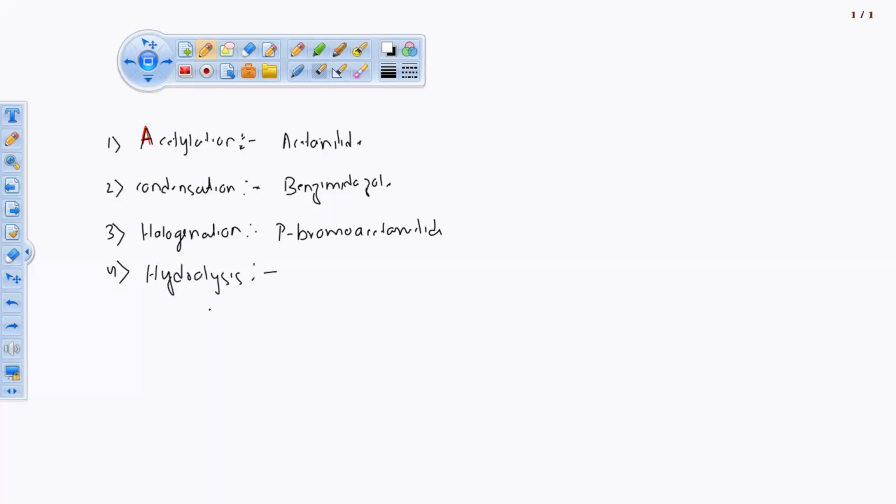By following this reaction, what kind of molecule are we going to synthesize. Here we are going to synthesize an example already given, already mentioned in your syllabus, an example related to hydrolysis. That is hydrolysis of methyl benzoate. हमको क्या करना है, मिथाइल बेंजोएट का हाइड्रोलाइसिस करना है, बेंजोएट.